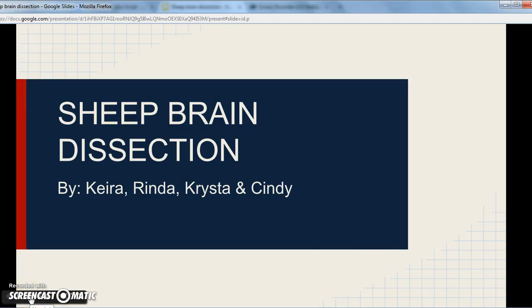This is our sheep brain dissection video by Keira, Krysta, Rinda, and Cindy.